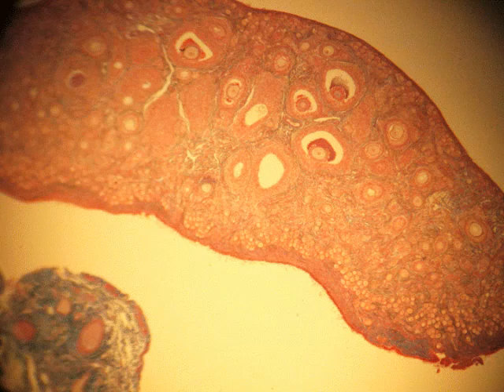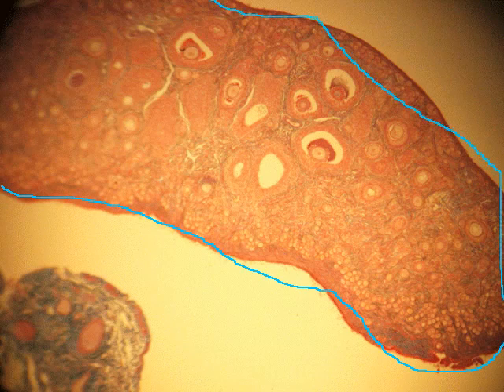All right, we'll just look at a very few slides of the ovary. That will be the only female reproductive organ we'll look at through the microscope. This first one is showing you a very low power, the scanning power of an ovary, and it's all of this area that I'm encircling. Okay, so all of that.